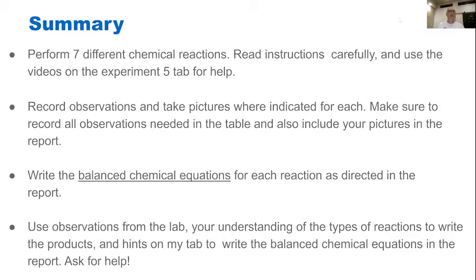So we're going to be performing 6 different chemical reactions, although you will be responsible for all 7, since I'm going to show you the reaction that we're not going to do, the precipitation reaction, basically show you how that works. It's really important that you've read the instructions for these, because like I said, there's a lot of different stuff we're going to be doing.